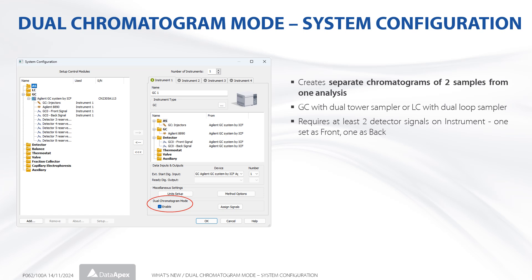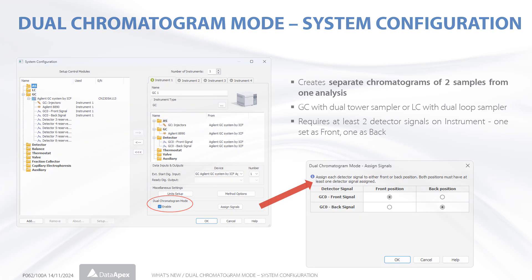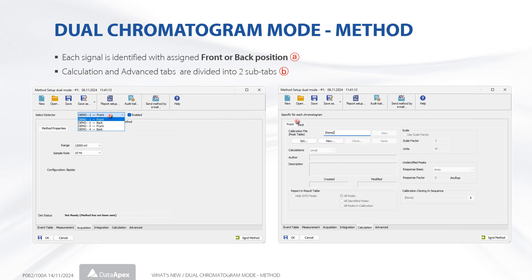At least two detector signals should be assigned to the instrument, one to the front and one to the back position. Positions are selected in the assigned signals dialog. In the dual chromatogram mode, every signal in the method setup dialog has an assigned position, either front or back. The calculation and advanced tabs are divided into two sub-tabs, one for each position.